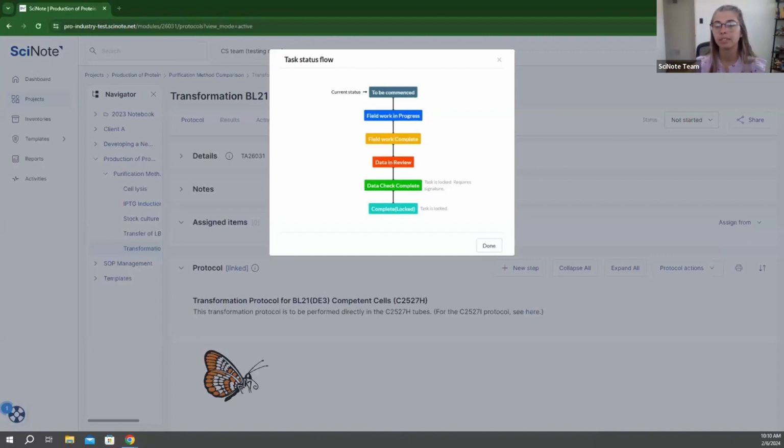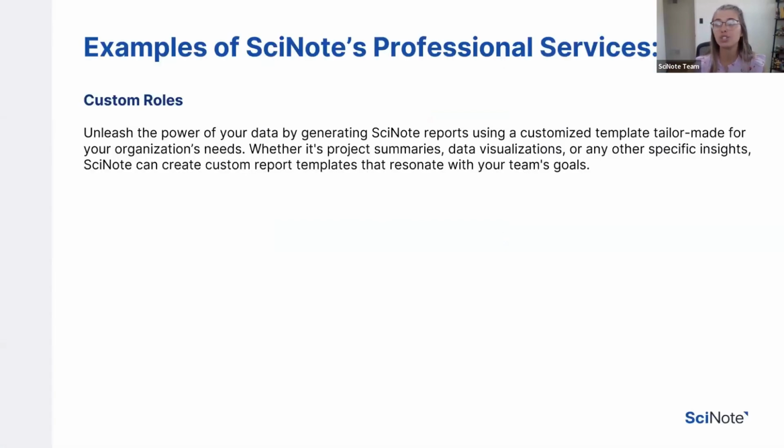All right. So if you have questions as we continue, like I said, drop it in that chat or Q&A, raise your hand and we can go over it. But if not, we're going to transition now into custom roles.